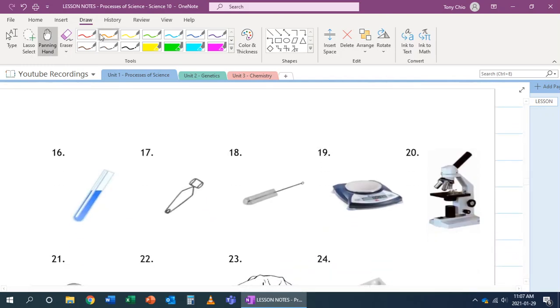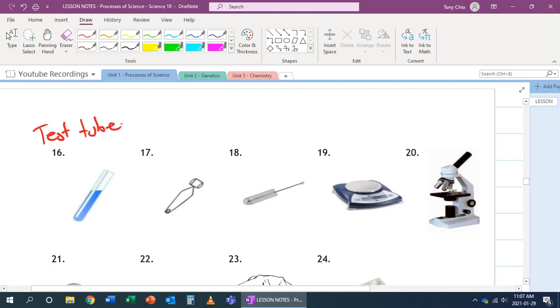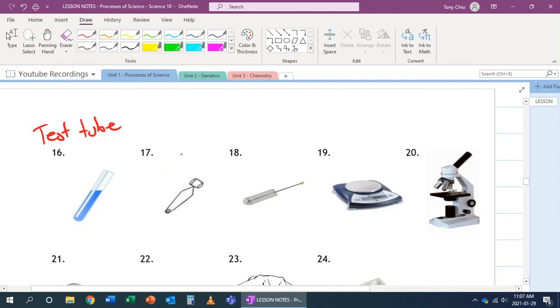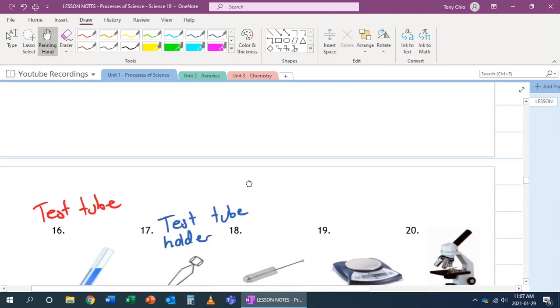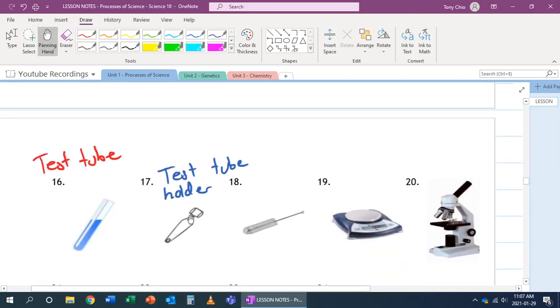Alright, number 16. Number 16 is what we call a test tube. So it's used to conduct experiments, and we can use it to heat up something, for example. Number 17, this is called a test tube holder. What we use this for is that we use this, we clamp a test tube to this end right here, and we can use it to heat up a test tube, for example, by hand.